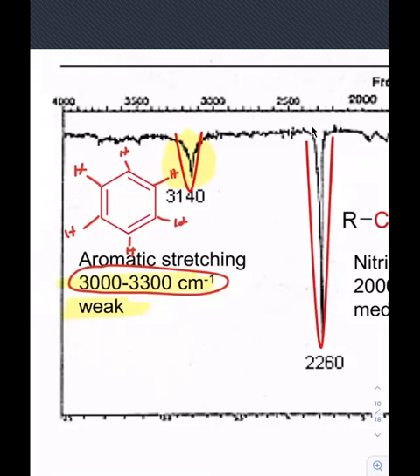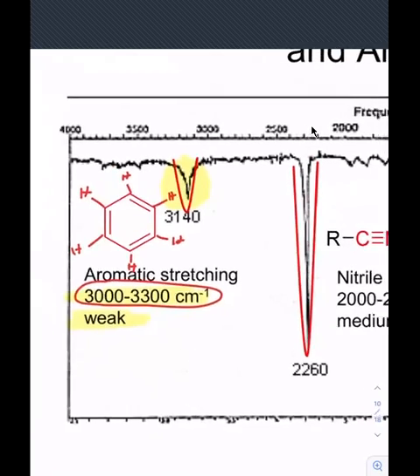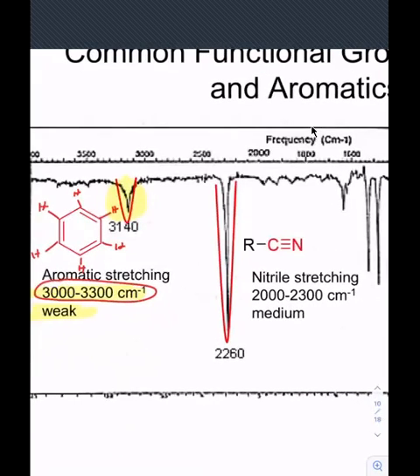It's only to determine what functional groups are present. But if you have functional groups that have similar stretches, then sometimes they may overlap with one another. You may be able to see one and not the other. It just depends. All right. So over here, these are just common stretches. So you're expected to at least have these if you don't know anything else.